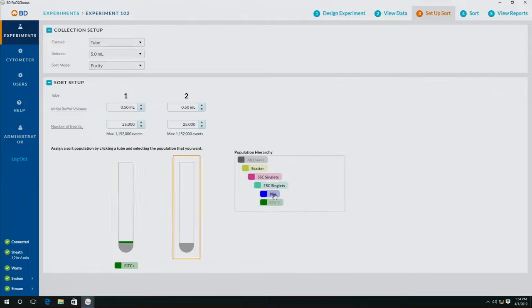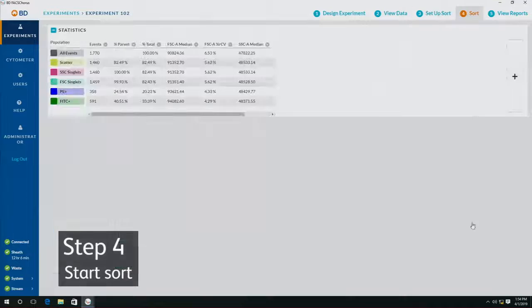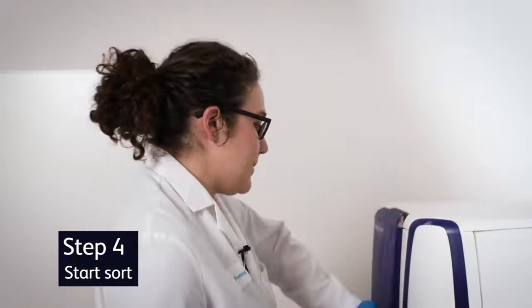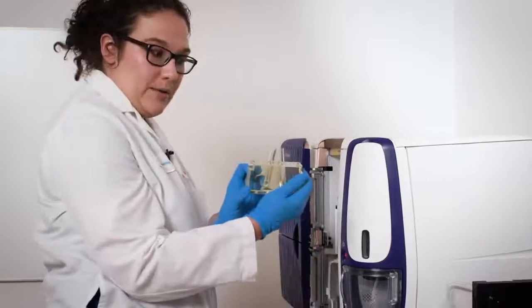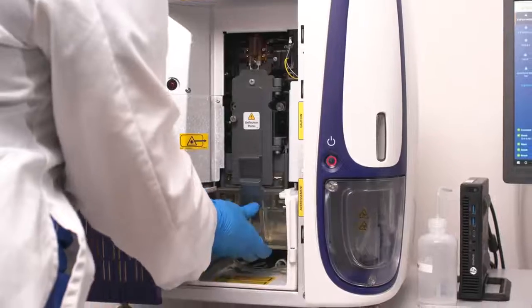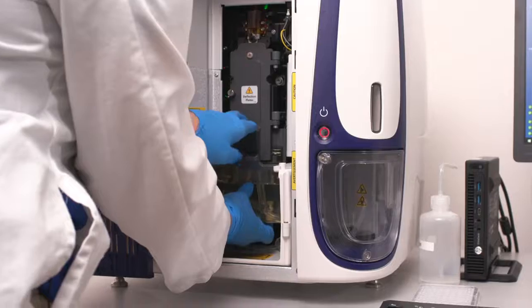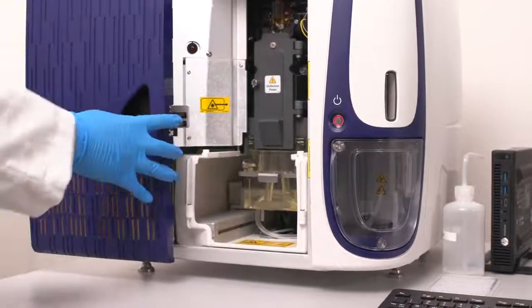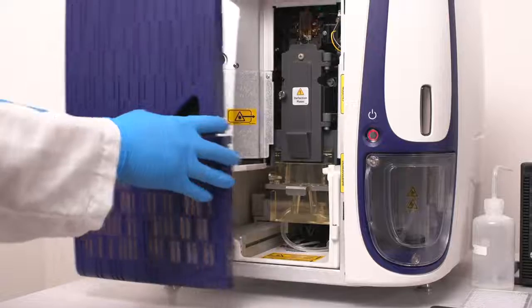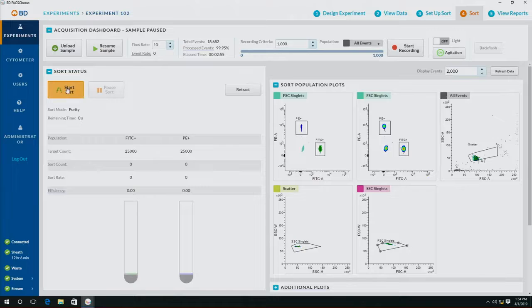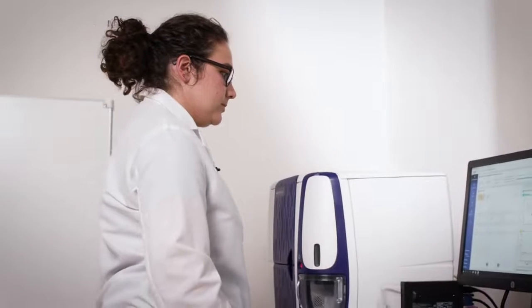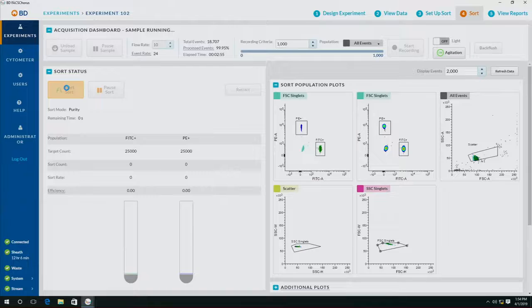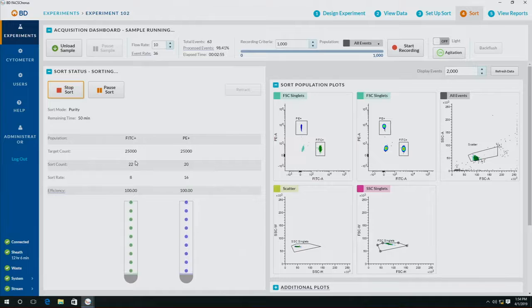I'm now ready to go to sort. Here I'm going to make sure that I have tubes to sort into. When I'm going to be ready to sort myself, I'm going to put it on, and now that everything looks right, I'm going to click Start Sorting.